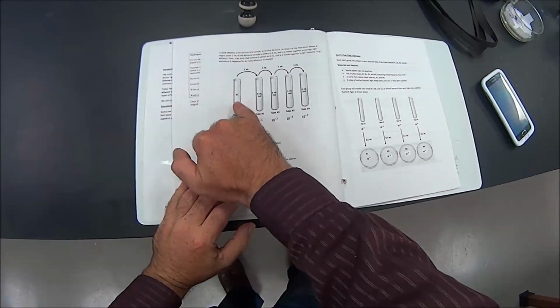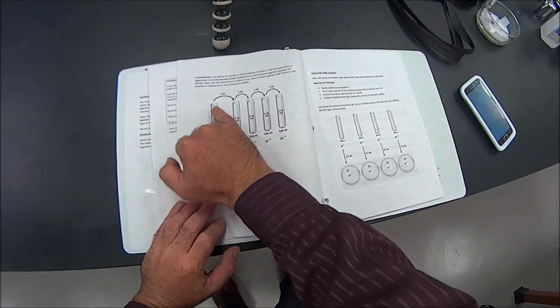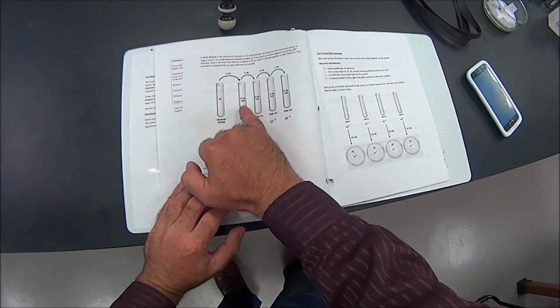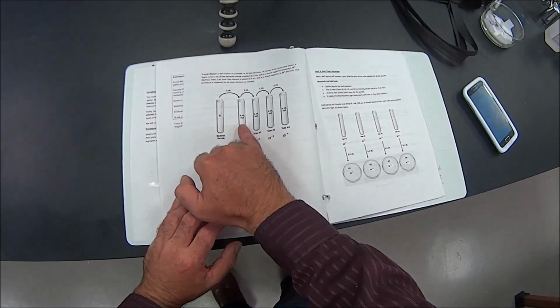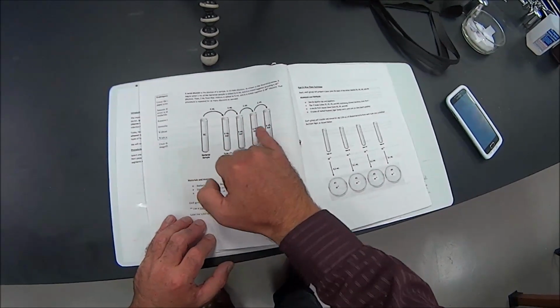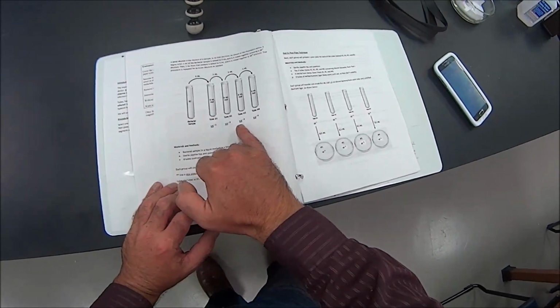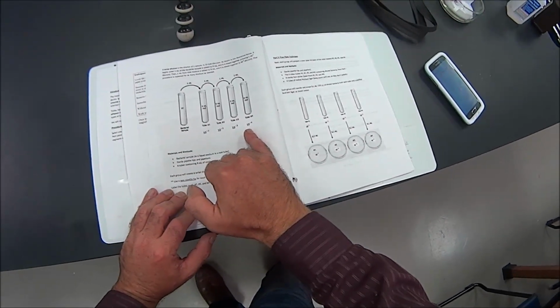Okay, we're going to take E. coli and dilute it 4 different times. We're going to take 1 milliliter of E. coli, add it to 9 milliliters of water or nutrient culture, and then we're going to keep doing this after we mix it together, and the resulting dilutions will be 10 to the minus 1, 10 to the minus 2, 10 to the minus 3, 10 to the minus 4.